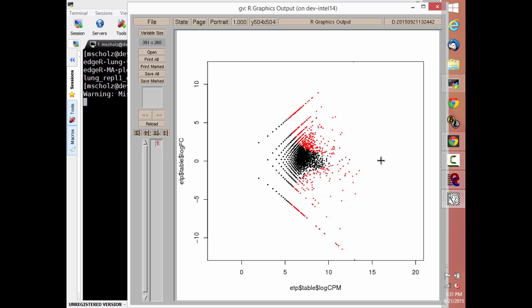So what do we think? How can you get those weird bits and pieces like that? Thinking back to my list of reasons how it calculates FDR, coefficient of variation is the short version of that same answer. The smaller the variation, the easier it is to make a call. If both of the samples have a very close call, and all of the other conditions have a very close call, even if they're only 15% different, if it falls outside of the expected error bars, it's something that you should consider a true differential.